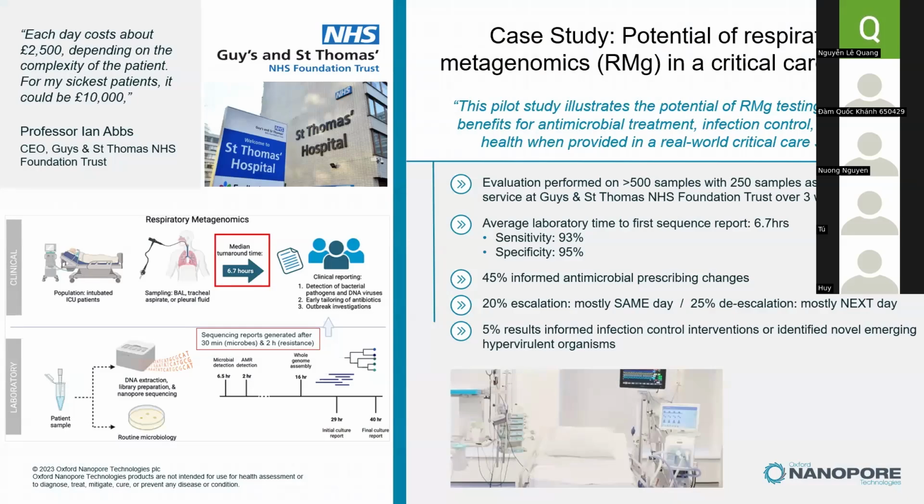So in the pipeline for the laboratory, at the bottom of the left-hand side, we can see that for the microbiome detection, it's around 6.5 hours. And then after we identify which microbiome, we detect the AMR in 2 more hours. So in total, we have around 8.5 hours, isn't it? Yes, I think this is a timeline on average.